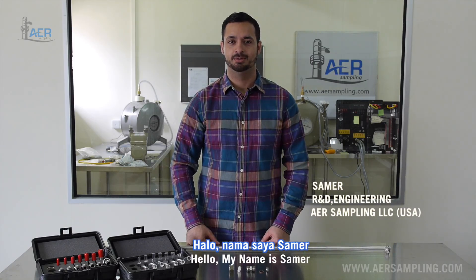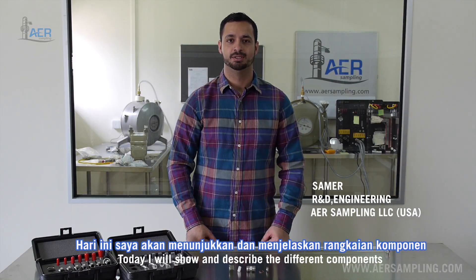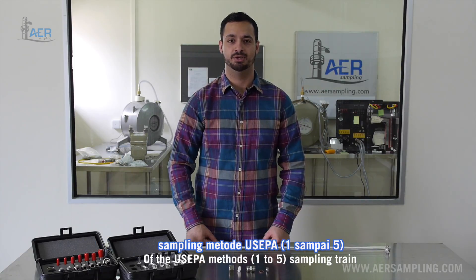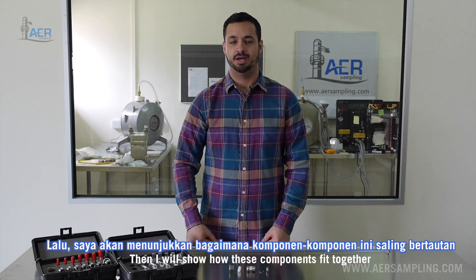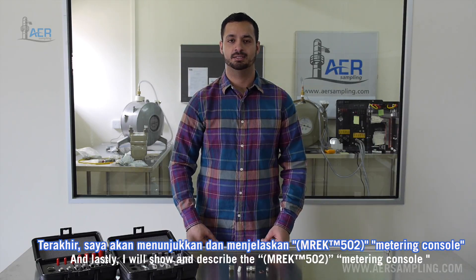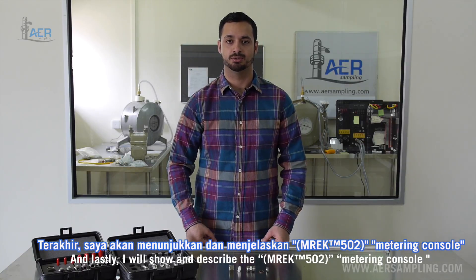Hello, my name is Samer. This is the AER Sampling basic training video. Today I will show and describe the different components of the US EPA method sampling train, how these different components fit together, and lastly I will show and describe the metering console.